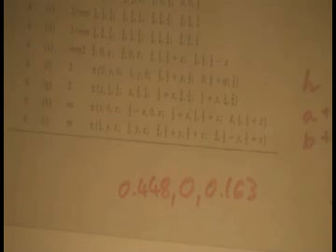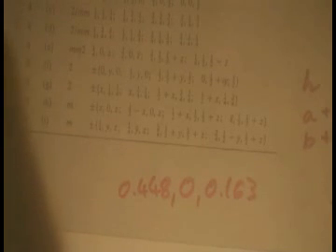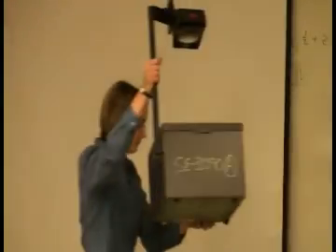So this was something that people could do way before they had powerful computers. Okay? That's why Patterson maps were very important, and they are still used nowadays. So, I hope that gave people a slightly better feeling for what a Patterson is, what it is useful for, what you can do with it, how you approach it.